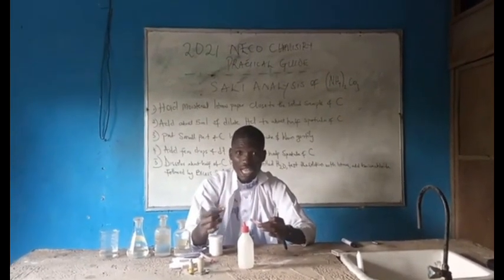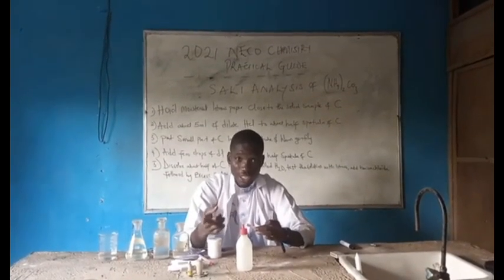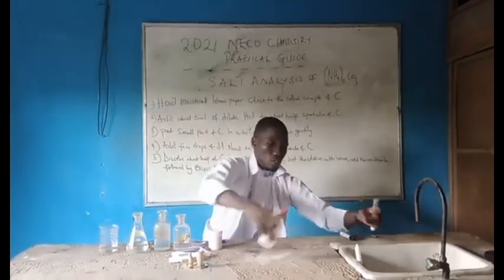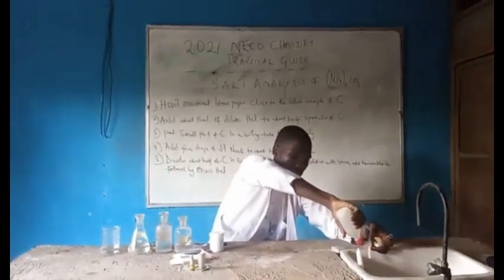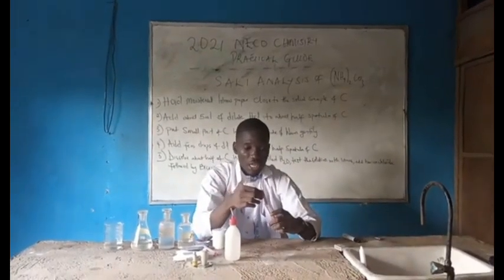It takes like a few minutes before it turns, but it's going to give us the result we need even in the place of ammonium carbonate. So let's moist this. You can see it. So you place it into the beaker.